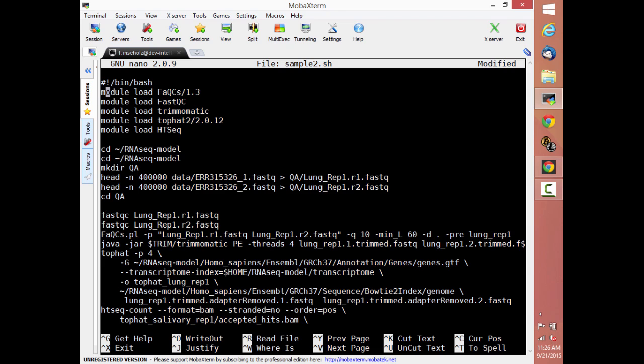Going back to what I said loudly and vehemently at the beginning of this whole section, replication is important. The ability to do the same thing again and have the same output come out is really, really important. Typing things on the command line is a really good way to not be able to replicate your work ever again. So the first step to that part of it is to try to do all of your analysis in some sort of script file so that all of the commands are right there. When you need to change them, you have to change the file itself and run the whole program again instead of typing a slightly different command. It's also a really easy way to be able to change a couple of things and say use this exact same template for a different file, for a different input set.